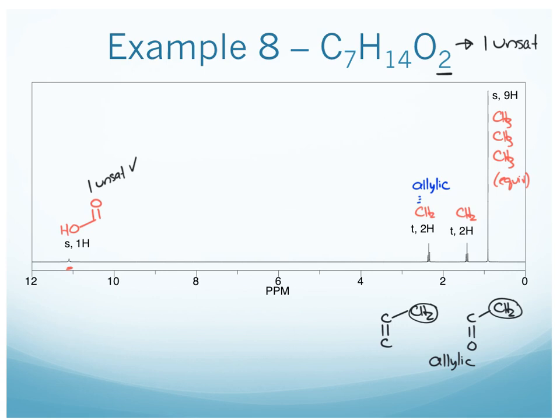So that's good. Okay, if we accounted for all 7 carbons, here's 1, 2, 3, 4, 5, 6. So there must also be a carbon with no hydrogen, in addition to the carboxylic acid carbon that doesn't have any hydrogen on it that we've already counted.